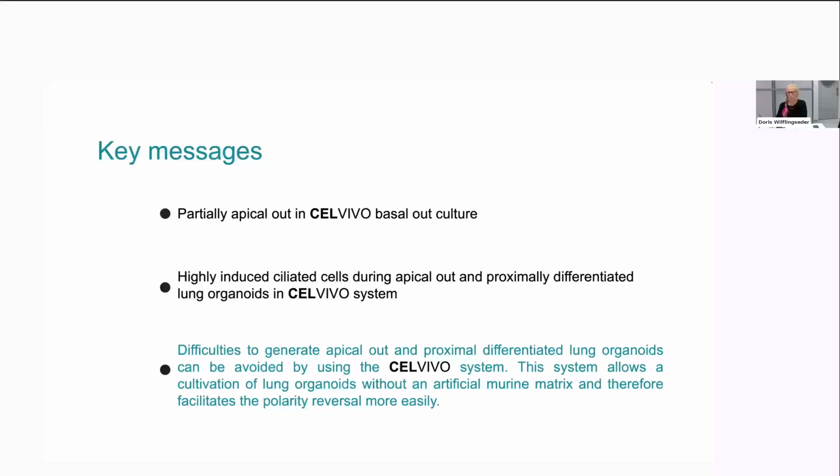We now did this more detailed characterization, and we think we have optimized these conditions. These two systems, as I told you before, really complement each other nicely, because on the one hand we can do high throughput with the organoids, on the other we can do more physiologic conditions.